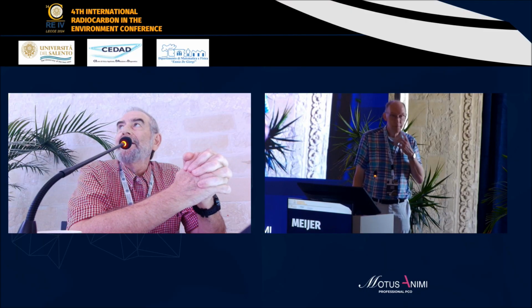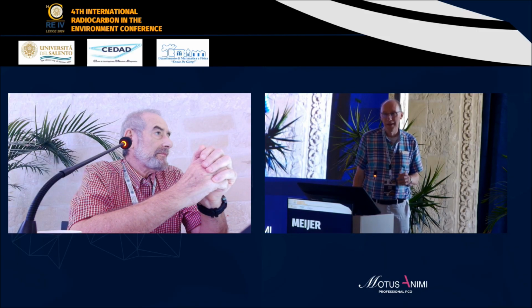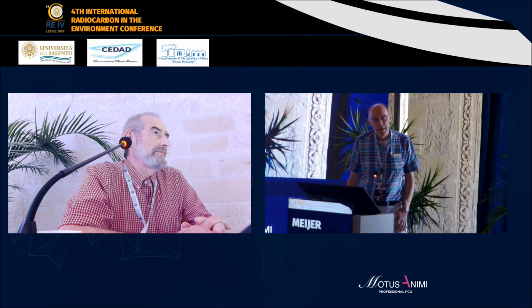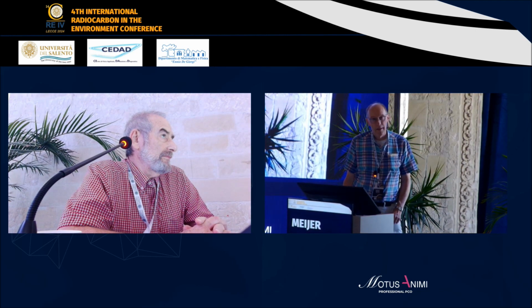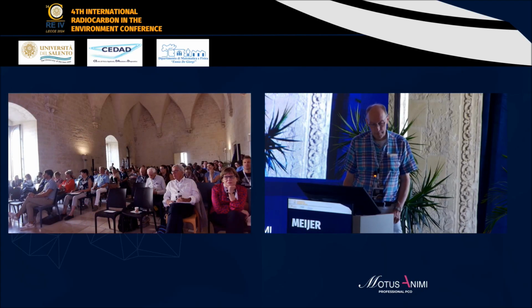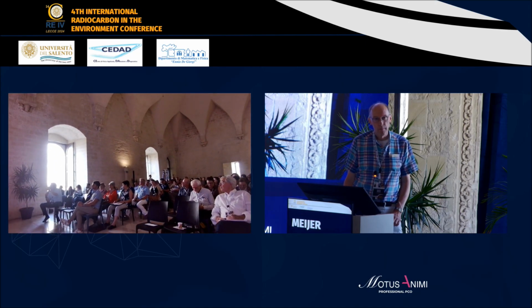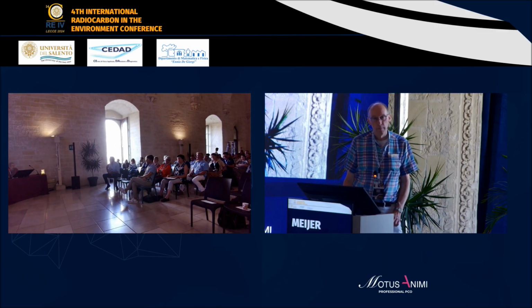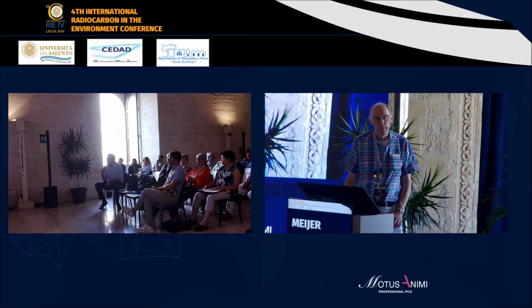Thank you. I see you. Oh, sure. Yeah, do you have an idea about what level of uncertainty we can expect with this new protocol? You know, because the ASTM protocol set about plus minus 3% absolute uncertainty for all the issues you were mentioning about the declining bomb peak and the uncertainty in the fractionation correction.